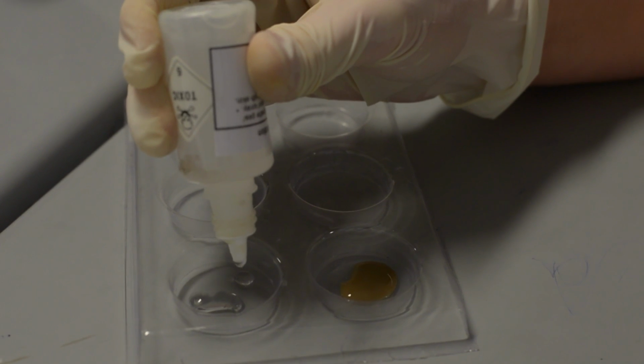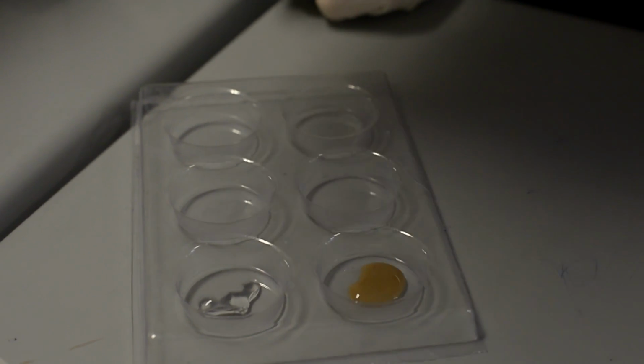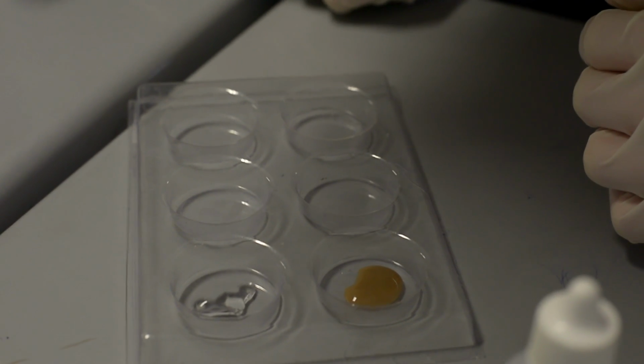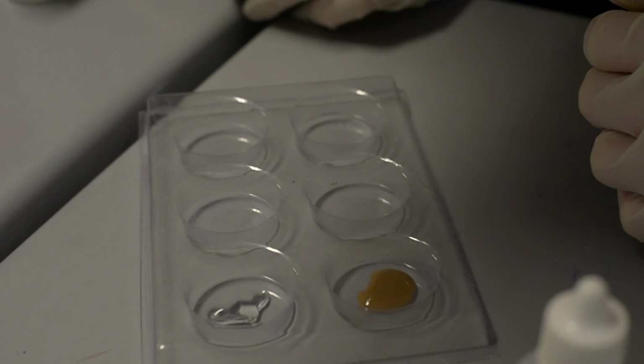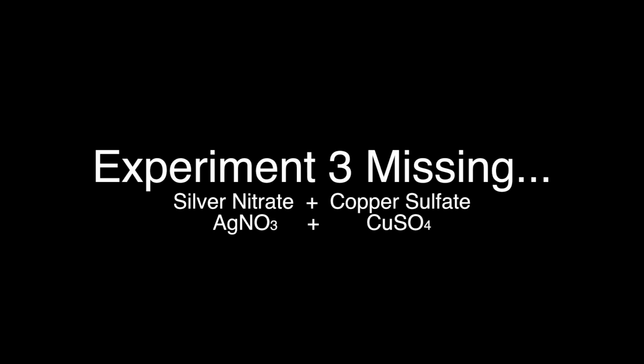Okay, girls, are you seeing any changes happening? No. All the things joined together. No gas? No. No colour? Nope. No heat change? Well, we can't really see any heat, but do we see any precipitate formed? No. Okay, no change at all.